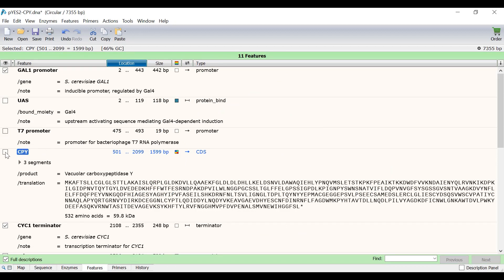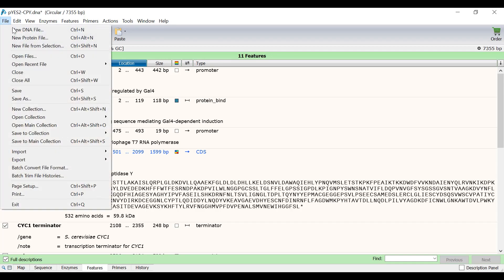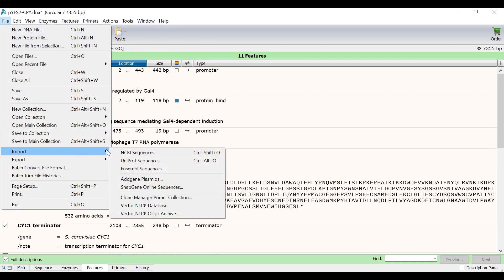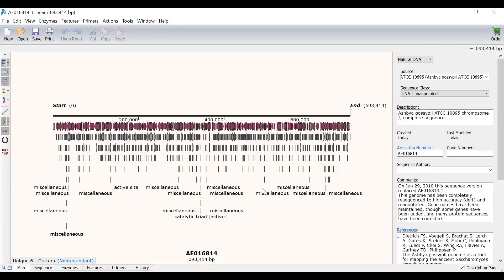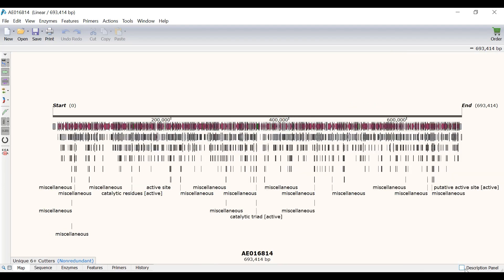In the last part of this working with features demonstration, I will show you how Snapgene handles a sequence with a lot of features. To do this, I will import a sequence directly from the NCBI database by going to File Import NCBI Sequences. I will enter the accession number for the sequence I am interested in and click Import. This sequence is a complete chromosome from a yeast species and is nearly 700,000 base pairs long. I will hide the description panel by unchecking the option in the lower right.